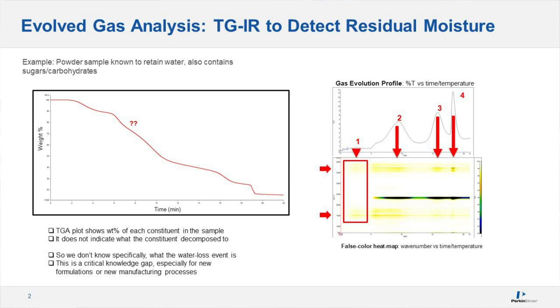The four major peaks are the intensities of gases released from the sample. The bottom right image is what we call a false color plot of wave number on the y-axis versus time. This false color image provides a visual representation of the range of intensities of the functional groups in evolved gases detected by the FTIR. The dark green solid band at 2380 wave number is for carbon dioxide — a known major breakdown product of carbohydrate. The two red arrows under hump one point towards intensities broadly in the region of around 3800 and 1500 wave number, which are known band assignments for OH groups — in this case from water vapor.